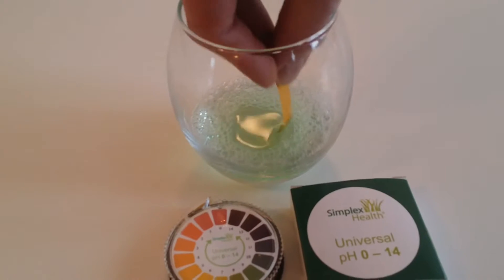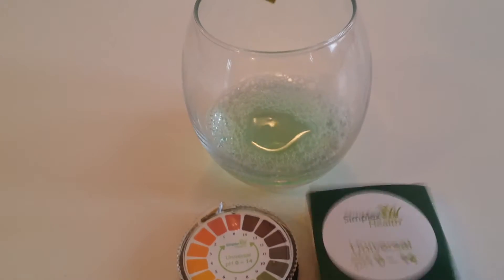What you do is you dip the litmus paper in, take it out, and shake off the excess a little bit.